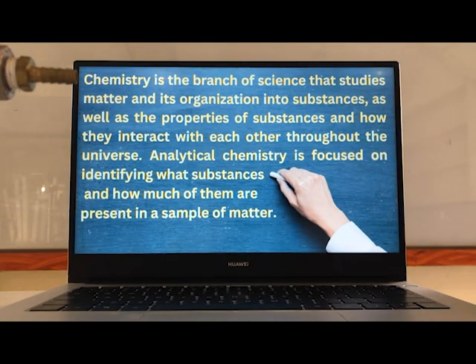And analytical chemistry is focused on identifying what substance and how much of them are present in a sample of matter. Kay diri sa amo ang report na atay 4 na student experiments. And then diha na atay mga series of mass, volume, grams, millimeter, ml, ganyan. Makaka-encounter talaga tayo ng mga ganyang mga measurements. So, halimbawa, diri sa isa na experiment naa ay isa ka flask na 100 ml na isulod na mga pure solution.